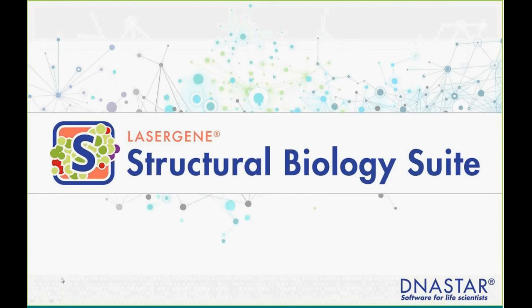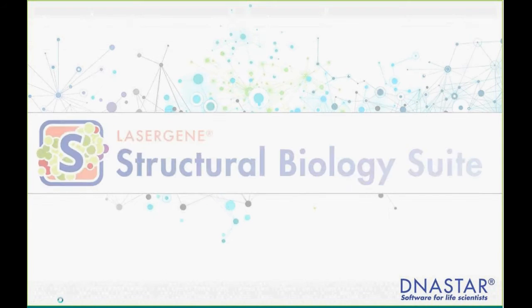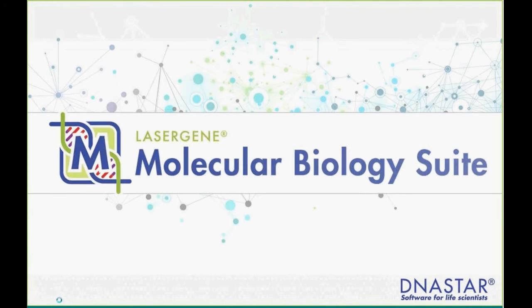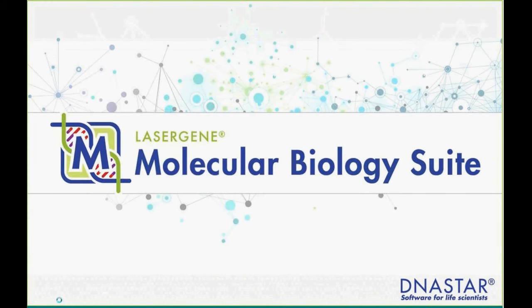Structural biology will offer some new software that allows us to do things like protein modeling and protein-protein interactions and antibody design. So today we're going to be focusing on that molecular biology suite, which is one of the three areas. And the molecular biology suite really is expansive in the number of different things that it can cover.